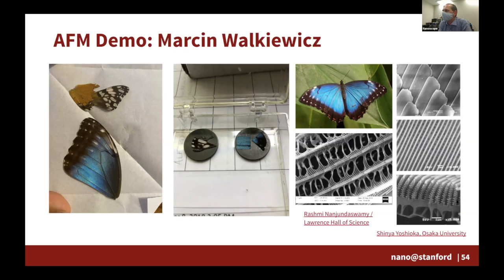Last night, if anyone watched The Strange World of Nanoscience, they talked about it in the video. We're going to take a look at that, which I think is really cool. These images here are all SEM images, like the ones that we used with Ryan, but we're going to use a different method so you can compare and contrast the differences.